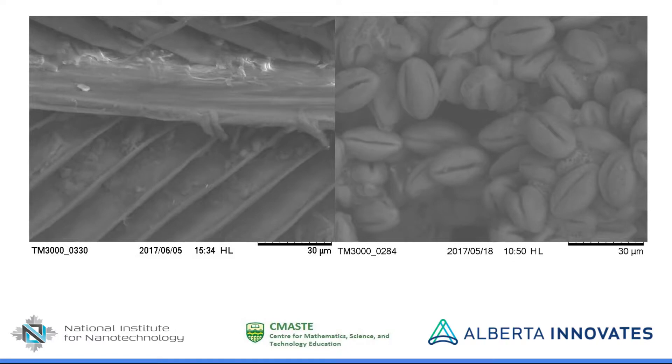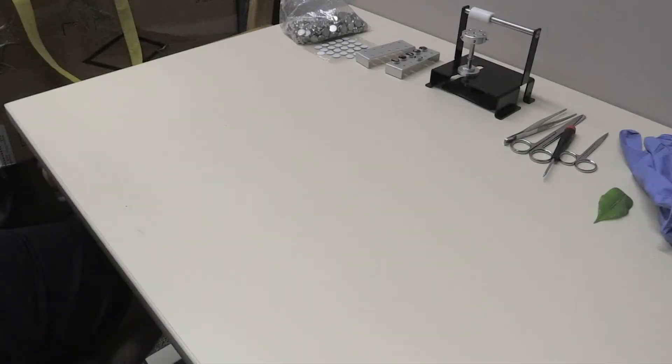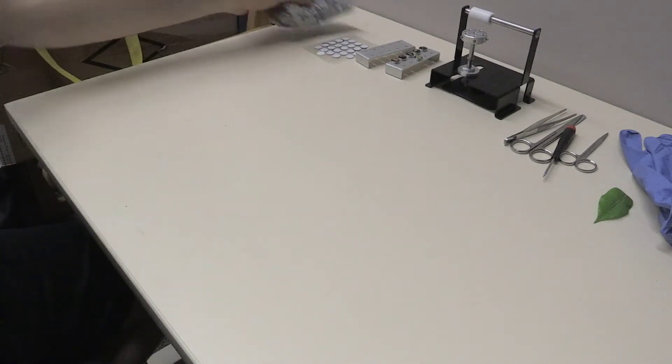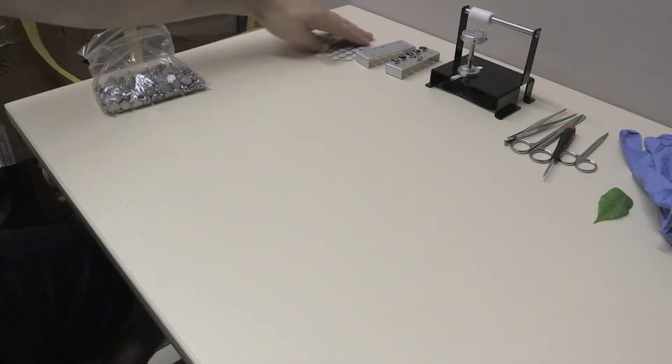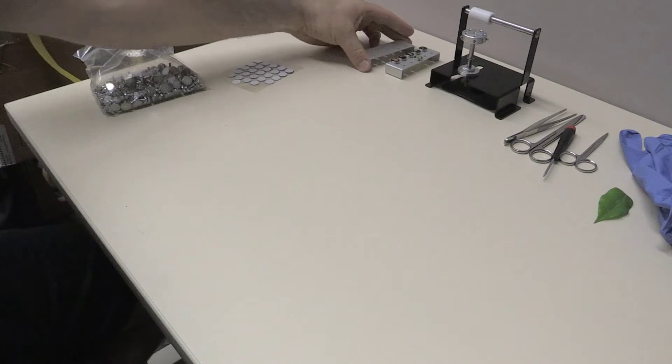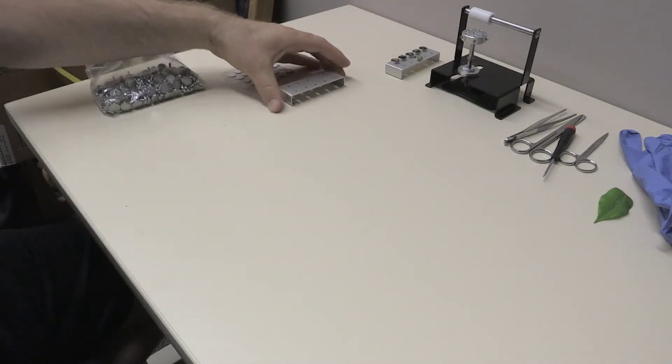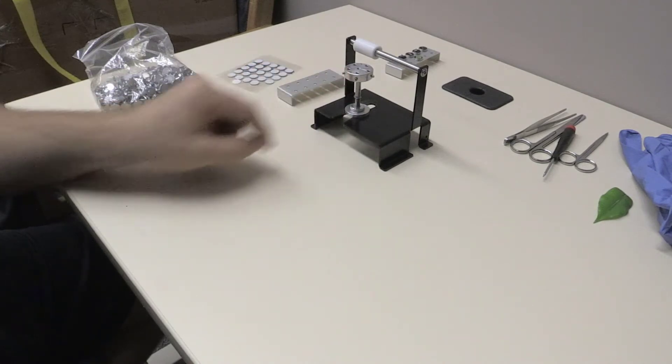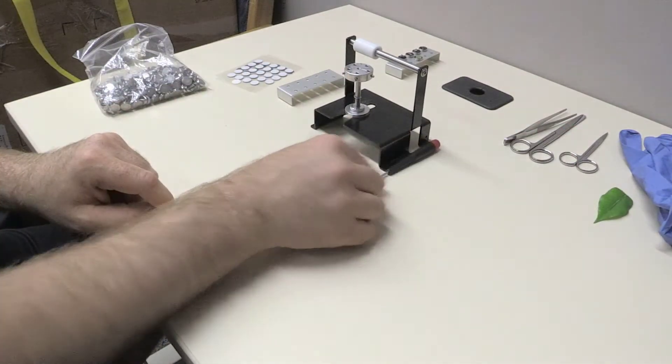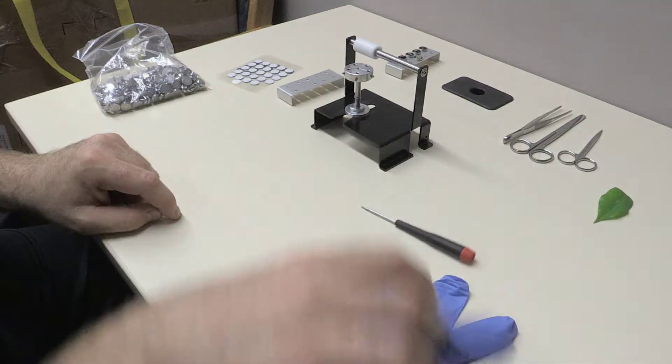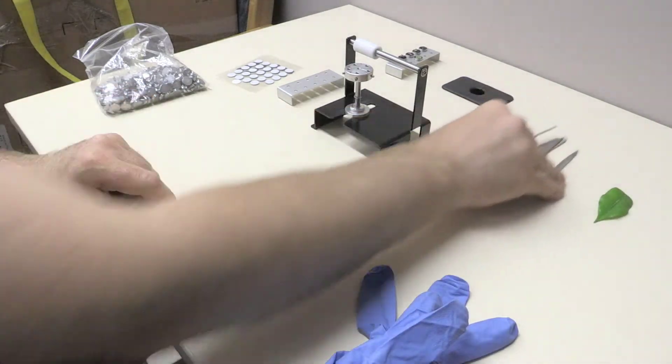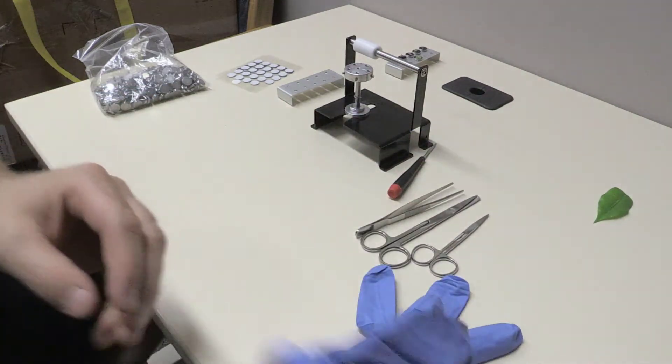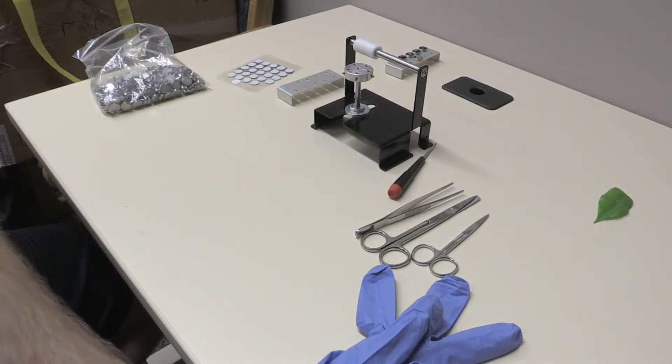To begin, ensure you have the proper supplies for preparing a specimen ready. You will need aluminum mounting pins, carbon stickers, a mounting pin holder, the SEM calibration device, the specimen stub and its associated screwdriver, latex or nitrile gloves, and any tools you may need to help prepare your specimen. This may include scissors, a scalpel, or tweezers.